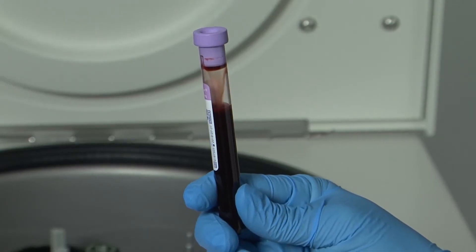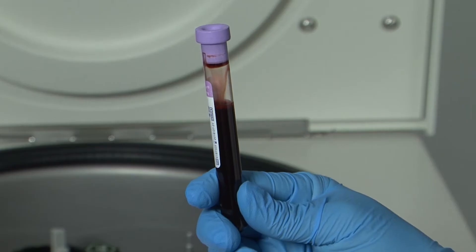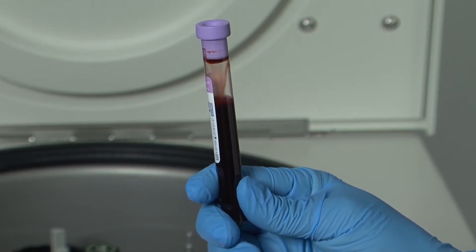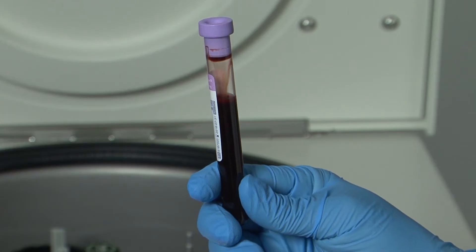A lavender top tube of blood contains red blood cells, white blood cells, platelets, and plasma. These tubes need to be centrifuged to accomplish separation.